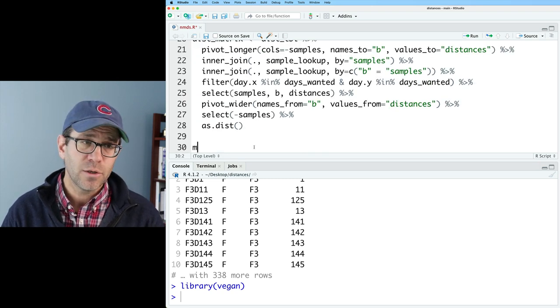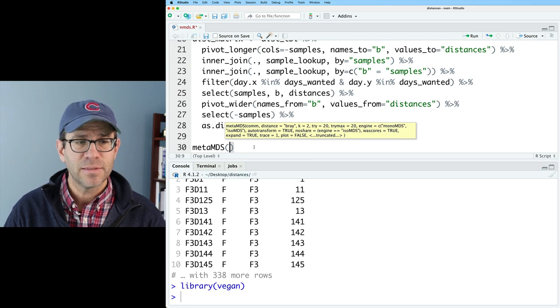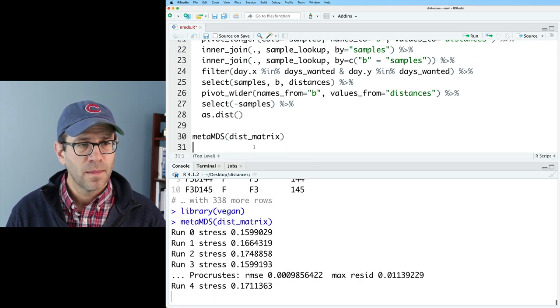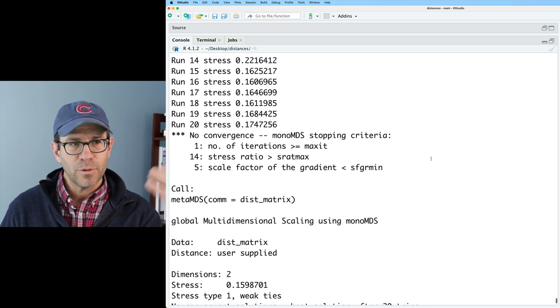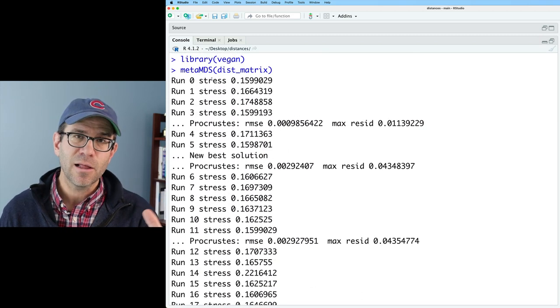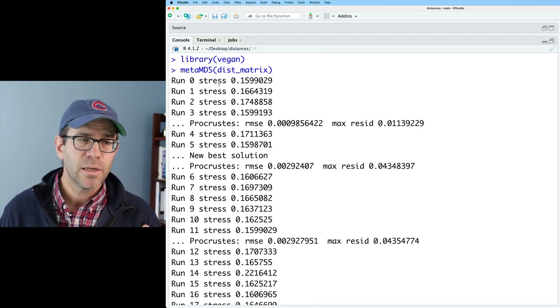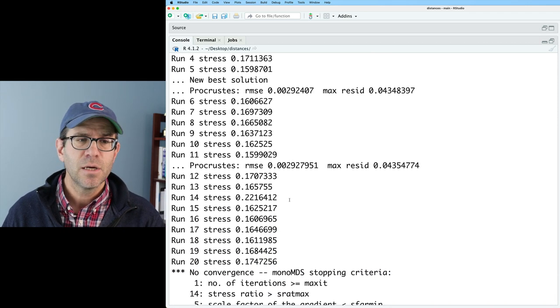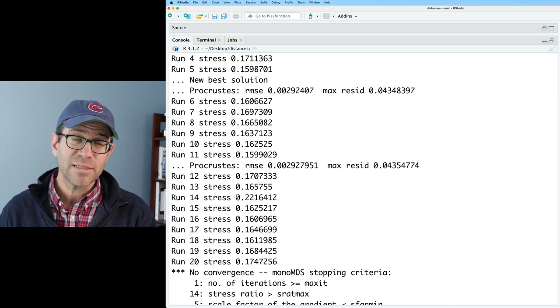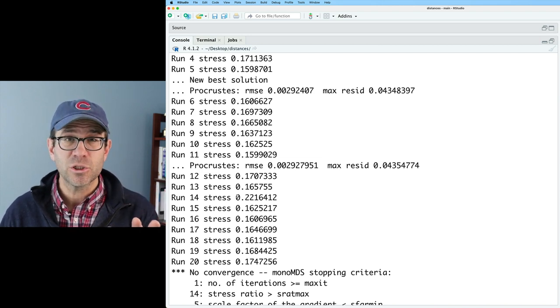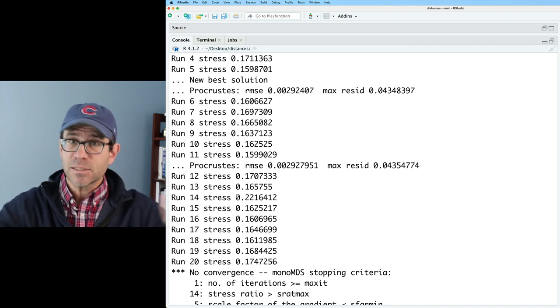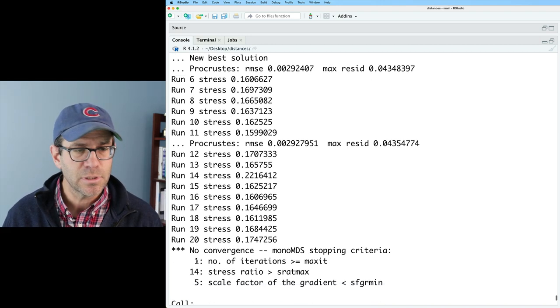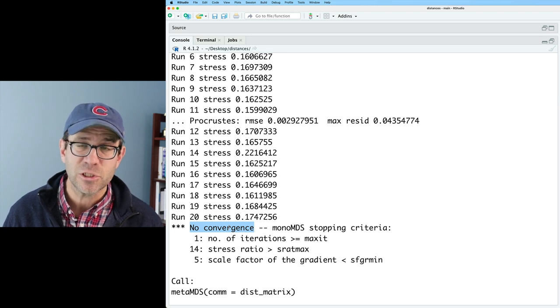To run the ordination, we're going to do metaMDS, and we will then give it dist matrix. The output then comes to the screen, and as I said earlier, the algorithm has a random component to it, and so it repeats the algorithm like 20 different times, trying to find the smallest stress value. The stress is, I think of, as the amount of distortion that happens when you take highly dimensional data and smoosh it down into two dimensions. So what I'm finding in the output is that there was no actual convergence.